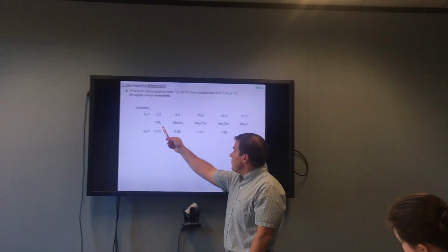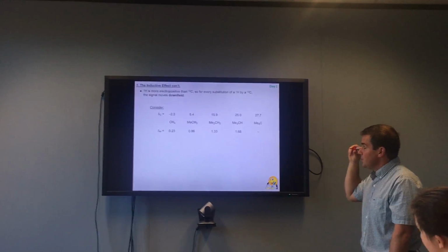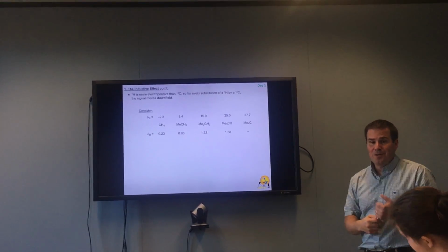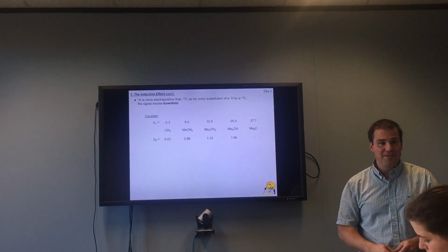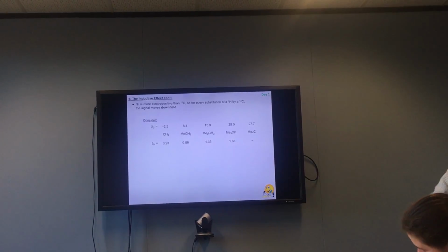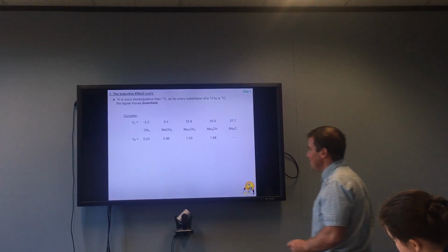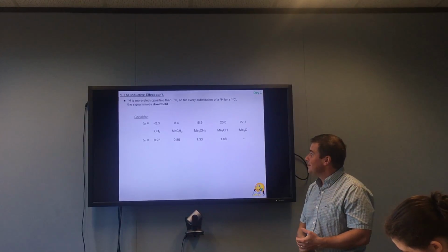So let's just focus on the carbon chemical shift for a minute. Let's start with methane. Not the world's most useful molecule, but you can take an NMR of methane for sure. You guys will see methane get generated if you're watching some catalytic cycle that spits out methane. You can watch it in the NMR, it's really fun. So methane, you'll see a carbon signal at -2.3.